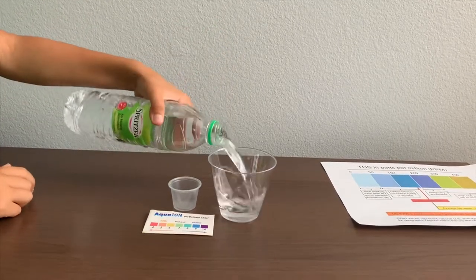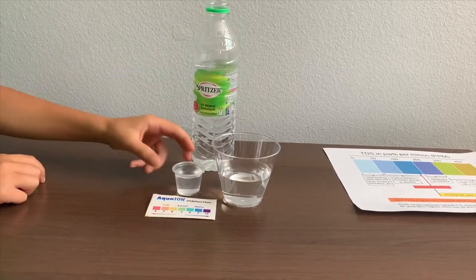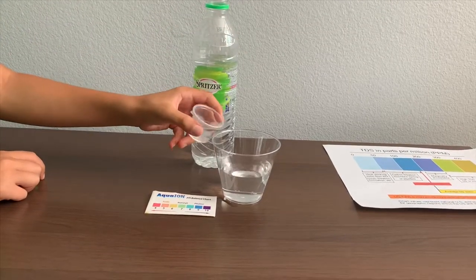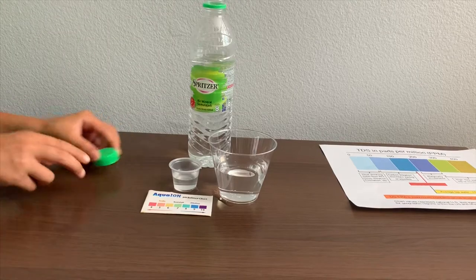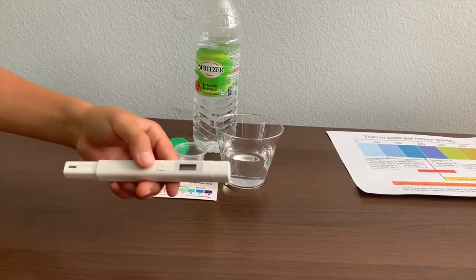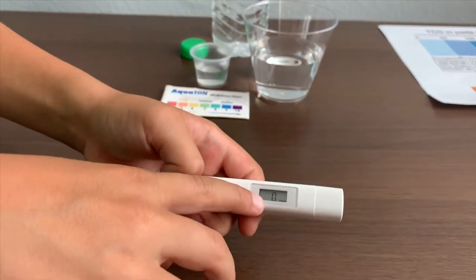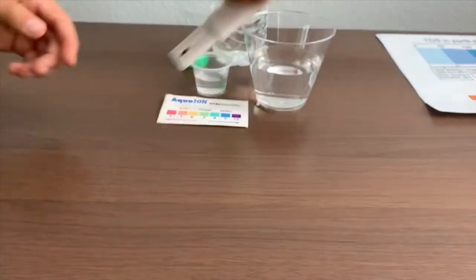Let's pour some water in. This is a little too much for the pH cup, so let's pour some back into the TDS cup. First, we're going to test the TDS level. If you want to buy this TDS tester, check the link down below. Turn on the TDS tester, make sure it says 0, and put it in.